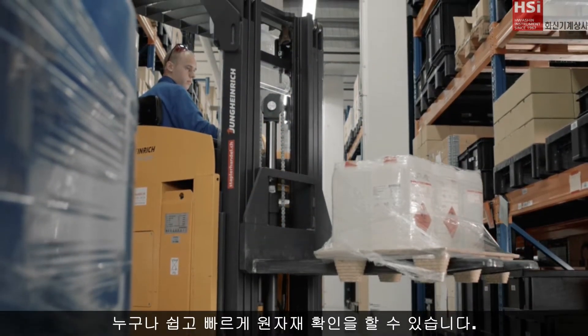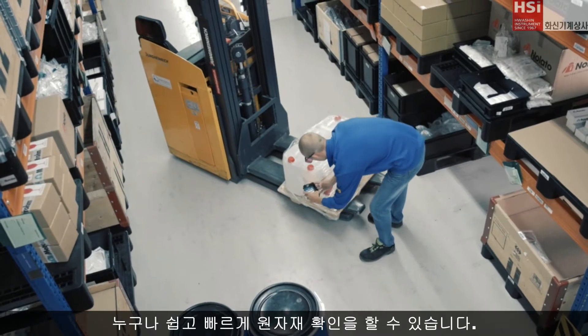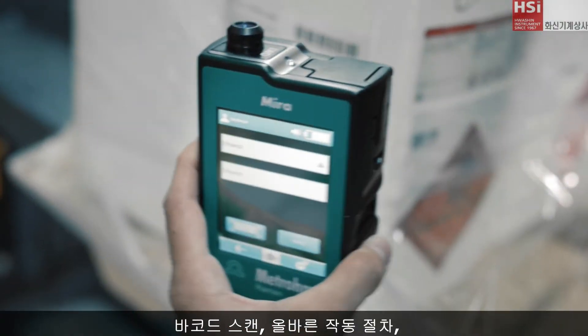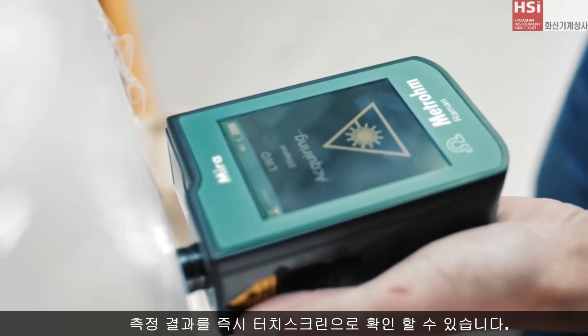Watch how fast and easy raw material verification can be for anyone. Barcode scanned. Correct operating procedure automatically selected. Instant result at the touch of a screen.